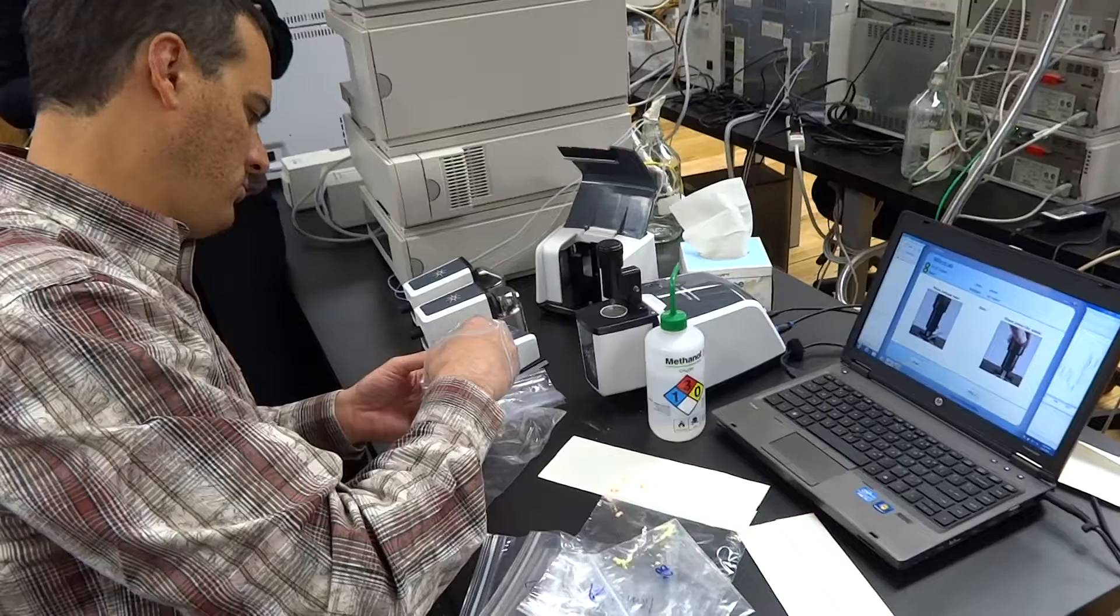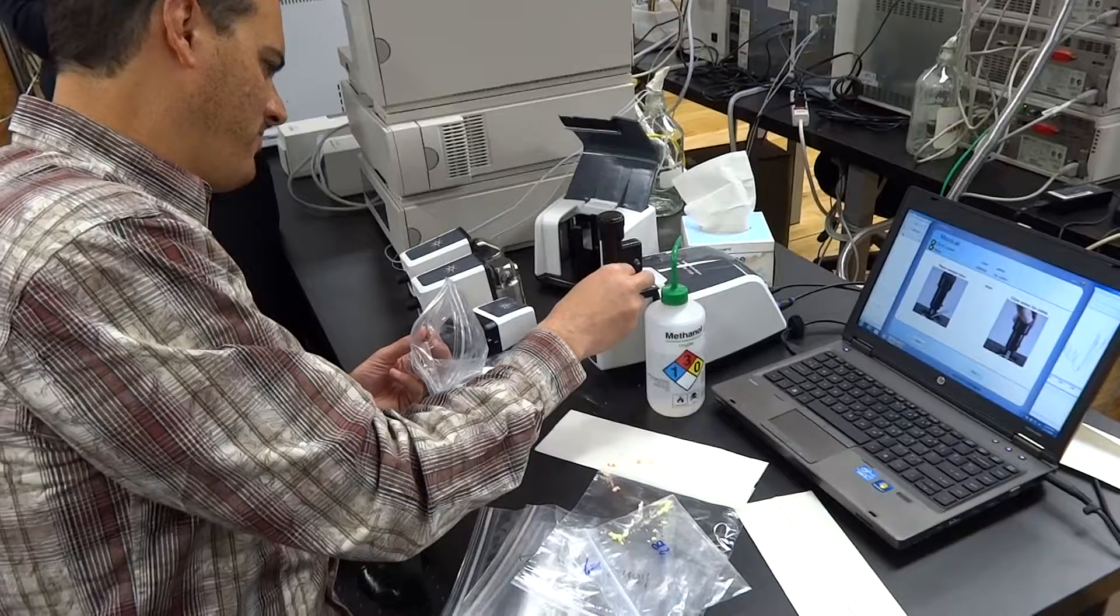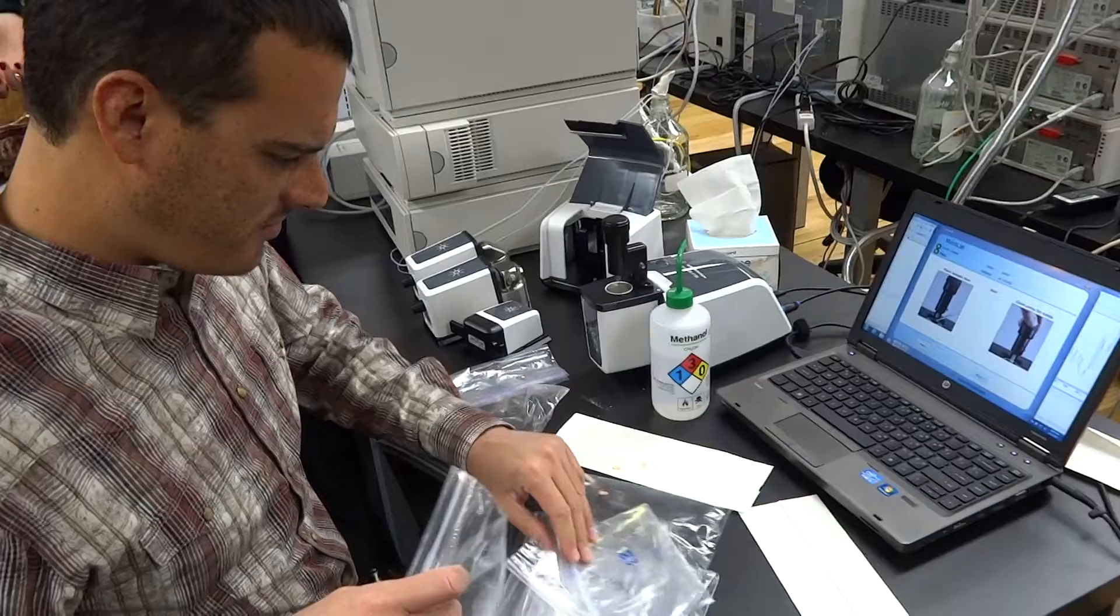And obviously you use a spatula, not your hands, I'd imagine. Because I have many customers who don't like laptops, but Josh has his own ideas on contamination control. Or you don't have to get a computer because it's a simple USB connection with basically any Windows server. You can save money on not buying them.